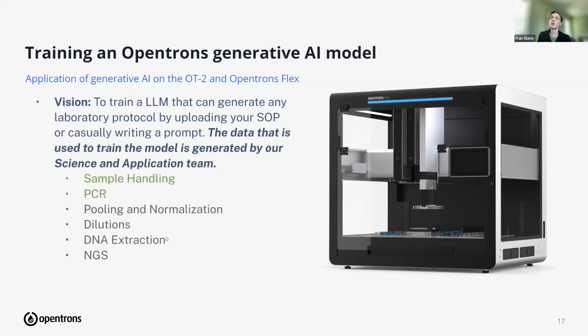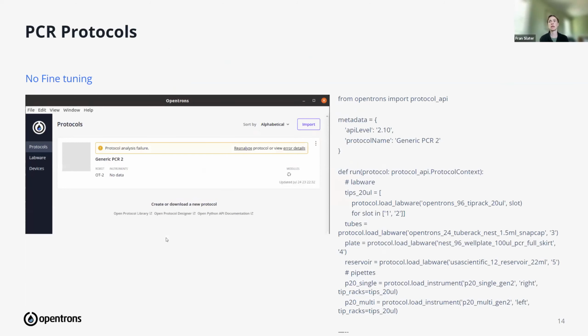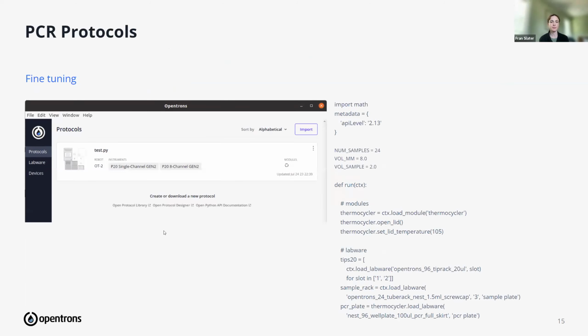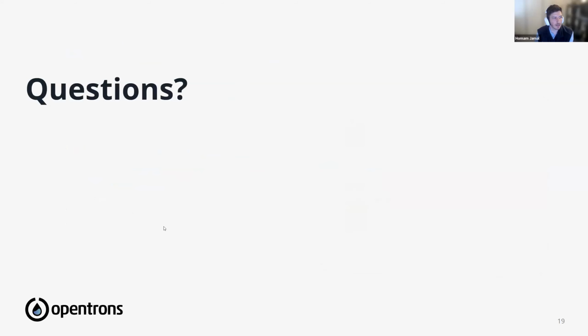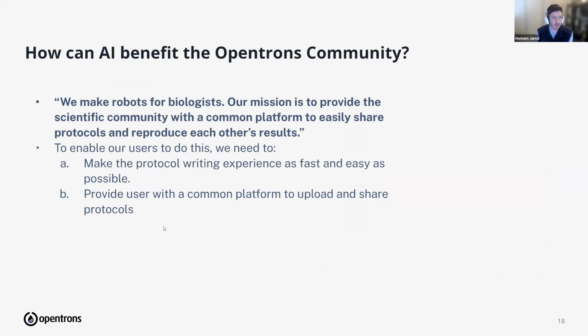Okay, and then there's a question from David. So on slide 15, so you might need to go back, was this solely the result of prompt tuning, or was a fine-tuned large language model also used? So it is a result of prompt tuning on the current GPT model. So we did not fine-tune the model, but we did prompt tune. So it's just the result of prompt tuning, yes.